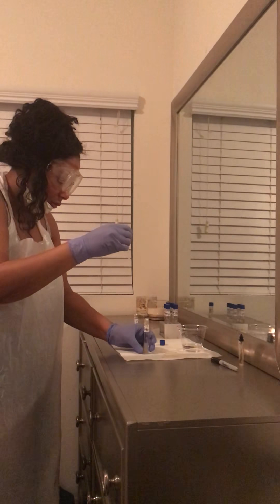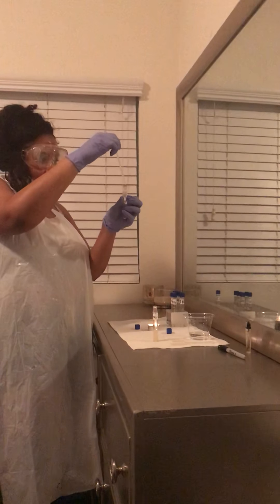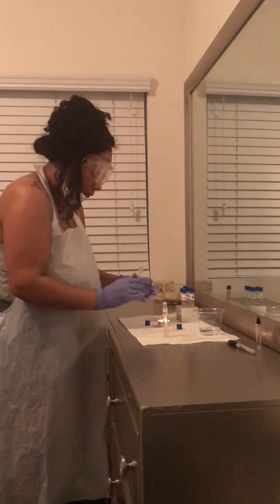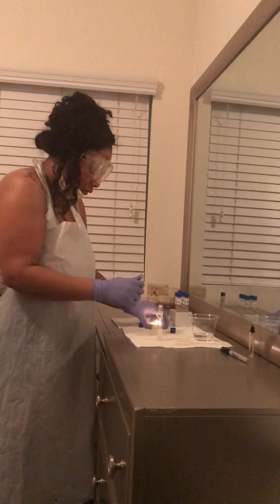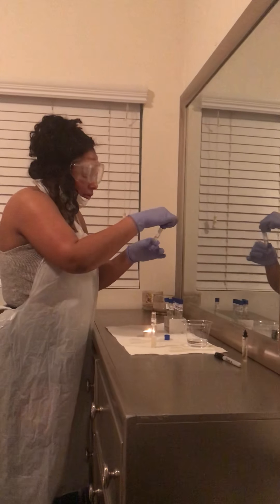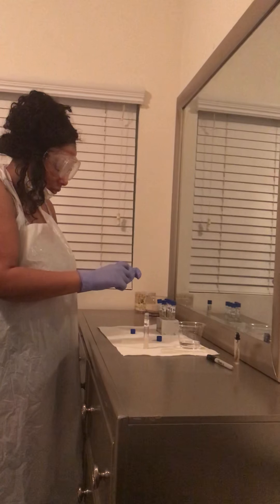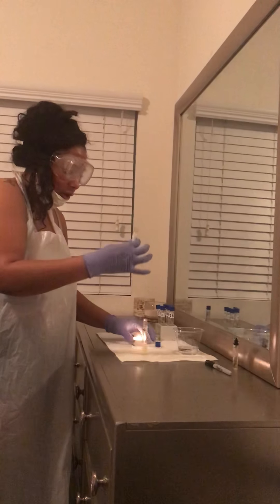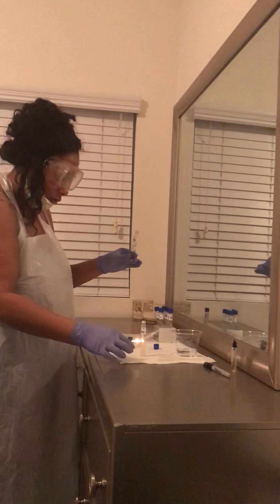Now I'm going to drop two drops of the active culture into the 1%: one, two. I'm going to go ahead and sterilize this and place our top on it. Now I'm going to grab the 7% NaCl. I'm going to go ahead and sterilize the rim. Now that we have it sterilized, I'm going to go ahead and pipette two drops into it: one, two. I'm going to sterilize this before we close it.